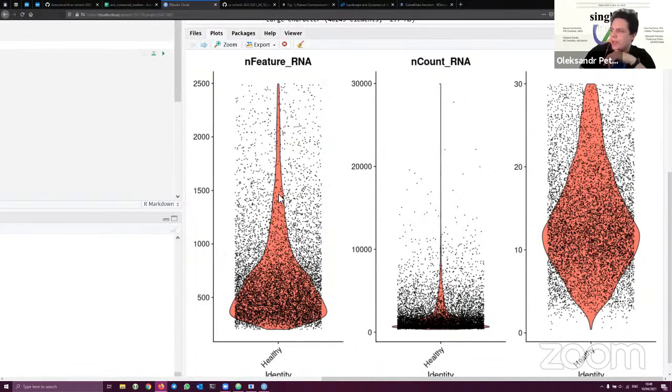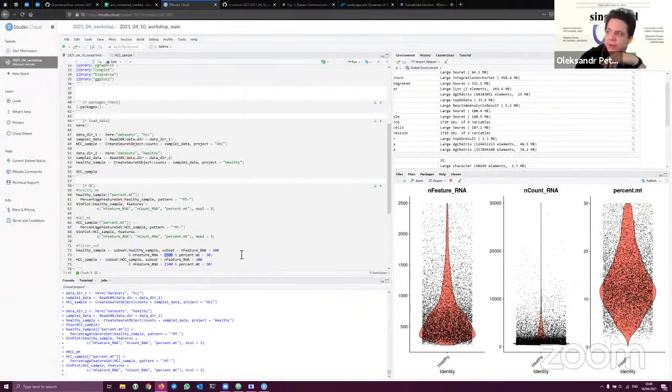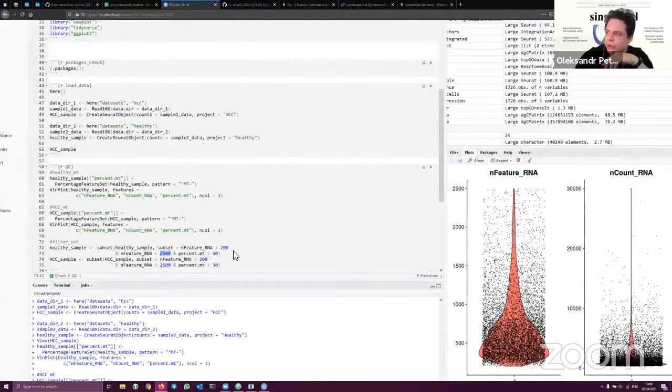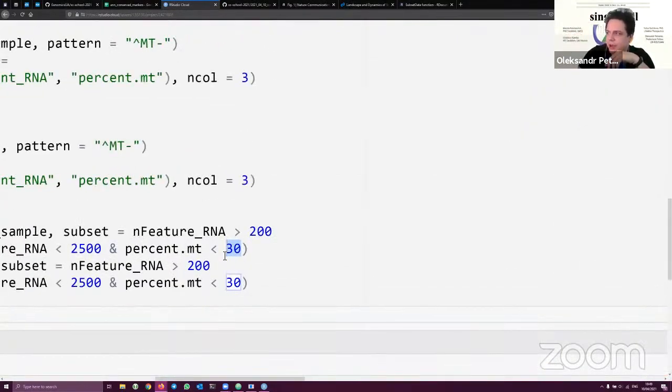And also another trick: if you see any papers related to your topic, just take a look at what they do. Sometimes it's not really helpful because some people filter totally differently. For example, as I mentioned yesterday, I think the very first papers, Seurat and Lieber, were filtering out all the mitochondrial content higher than 15%, which according to today's understanding is not the best solution.